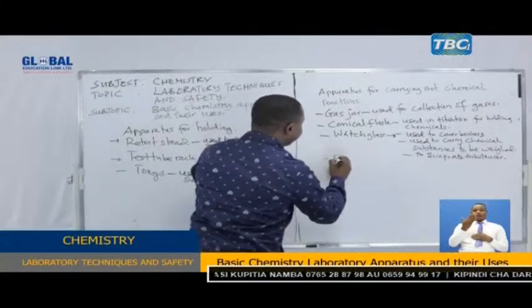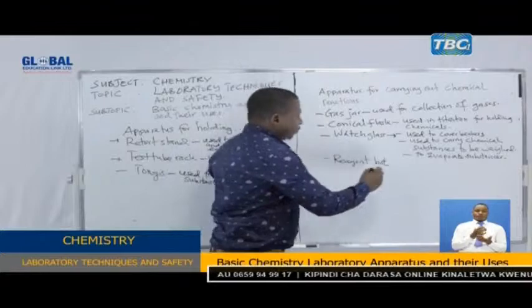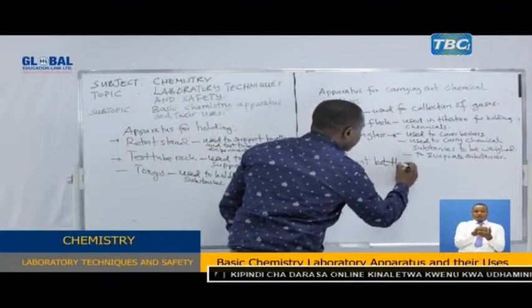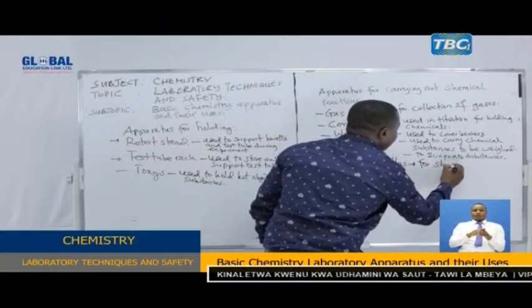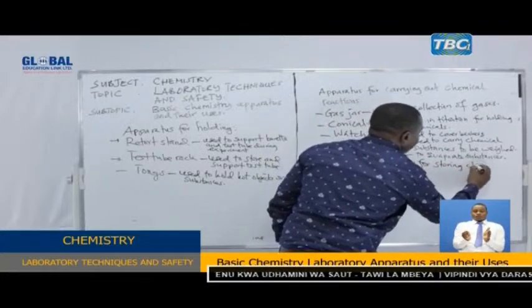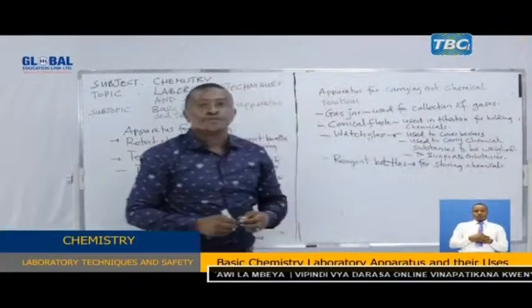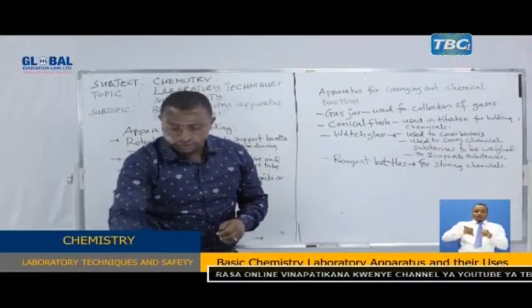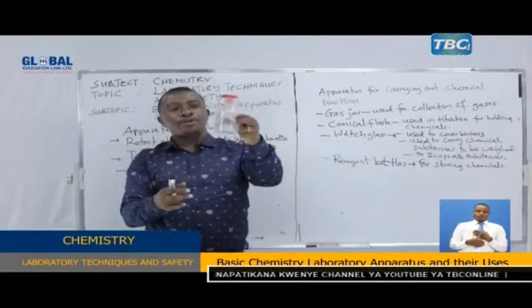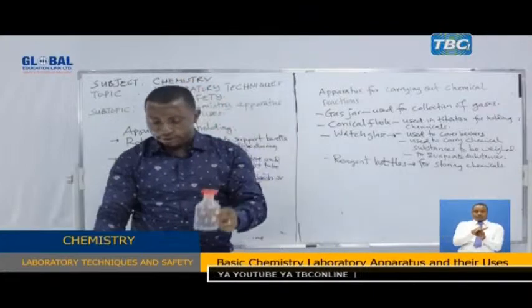We also have reagent bottles for storing liquid chemicals. This one here is a reagent bottle. You can see this is the stopper and this is the reagent bottle.